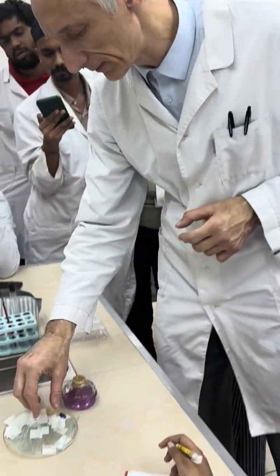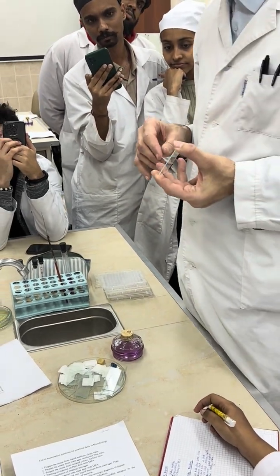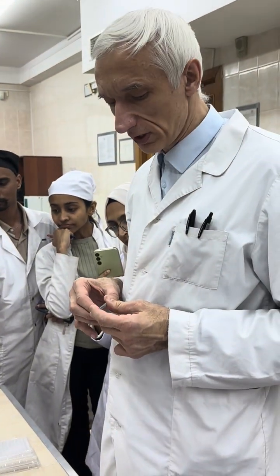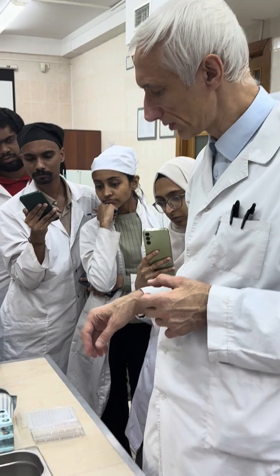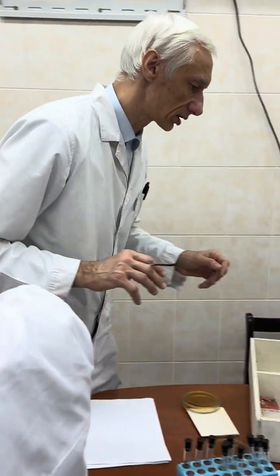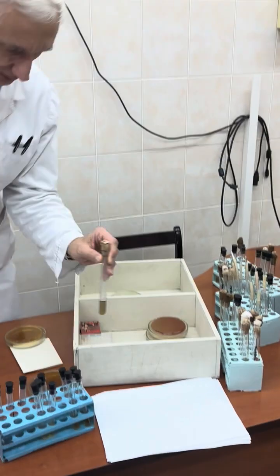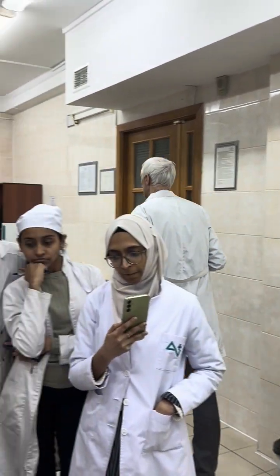Coming back to the slide. After removal of the soap, this slide needs something added. Here it is, saline. Saline should be added because it is a solid nutrient medium, slant agar, then I will show you. So people, now it is time to refresh how we take something. By the way, it's in the list. Where is saline? Here it is. And I will take an extra step.